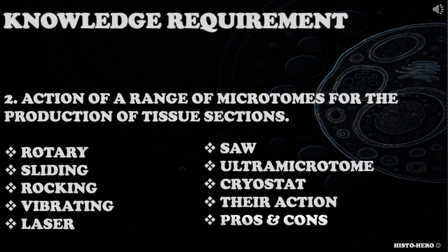and so on. When addressing this knowledge requirement, candidates should consider rotary, sliding, rocking, vibrating, or laser microtomes, saw, ultramicrotome or cryostat, their actions, or their pros and cons.